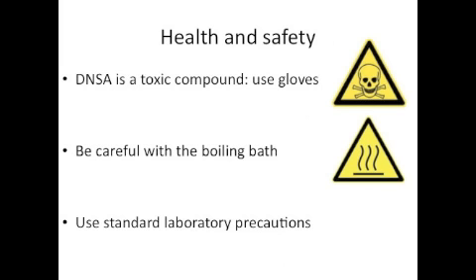When you come into the lab to do the experiment, remember that there are certain things that you need to be particularly careful about. The DNSA is toxic, and you'll be using a boiling water bath, which can always be dangerous, especially when there are a lot of people in the lab. You now need to proceed to do the quiz, which you will need to complete before you can come to the lab. I look forward to seeing you there.